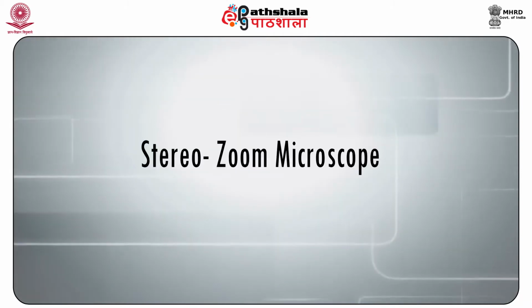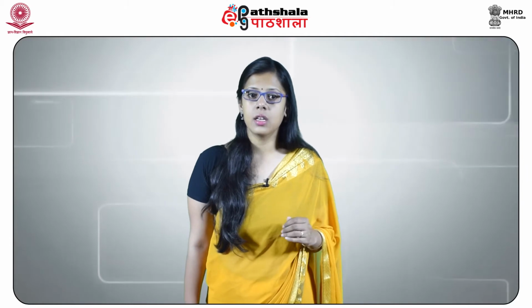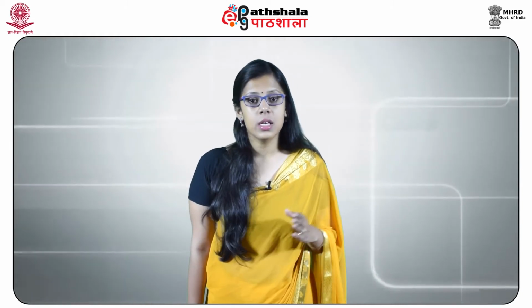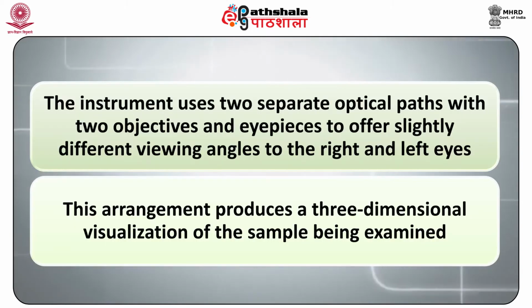The next instrument we have is the stereo microscope. The stereoscopic microscope is an optical microscope arrangement designed for low magnification observation of a sample, characteristically using light reflected from the surface of an object rather than transmitted through it. The instrument uses two separate optical paths with two objectives and eyepieces to offer slightly different viewing angles to the right and the left eye. This arrangement produces a three-dimensional visualization of the sample being examined.